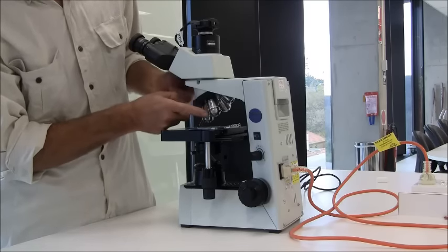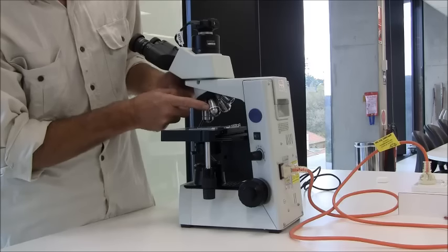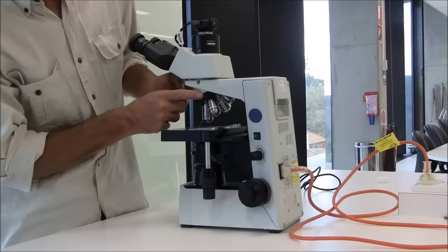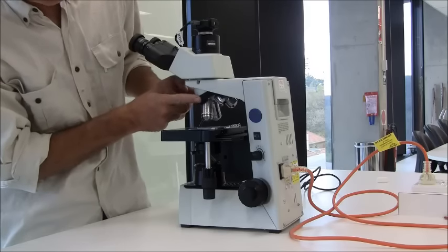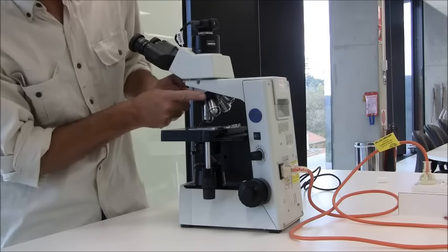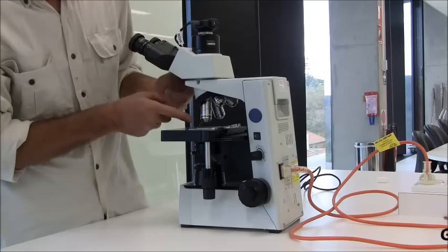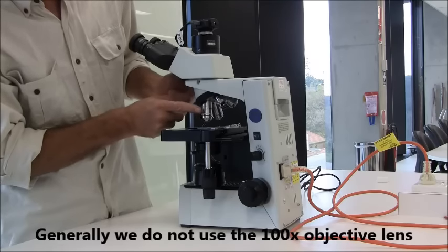The white and black banded 100 magnification objective lens is only used for special purposes, and it has to be used with a drop of oil that excludes air and changes the refractive index of the light passing through it. And we don't use that. In fact, I want you to be careful about rotating that lens into position. Quite often, if the specimen is fairly thick and you rotate that white lens into position, you're going to jam it into the specimen itself and maybe crack the slide or maybe even do some damage to the objective lens itself. So generally we don't use that one.